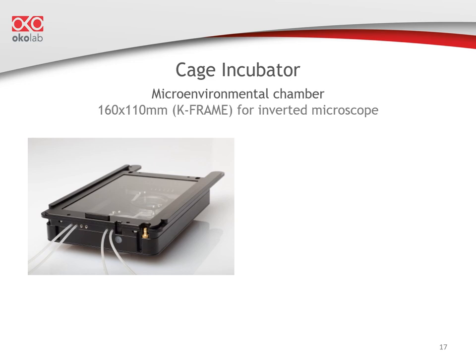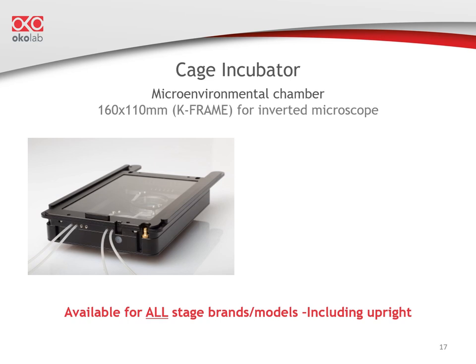To illustrate the microenvironmental chambers, I will use a K-frame for inverted microscopes as an example. A K-frame simply fits a microscope stage with an opening of 160 x 110 mm. Chambers for all stage brands and models, including upright, are available. OkoLab K-frame chambers have built-in perfusion holes plugged with small screws — you can unplug them if you need to do perfusion. The lid slides open and you don't have to put water inside the chamber to provide humidity. The sample is placed in the chamber using a magnetic insert.